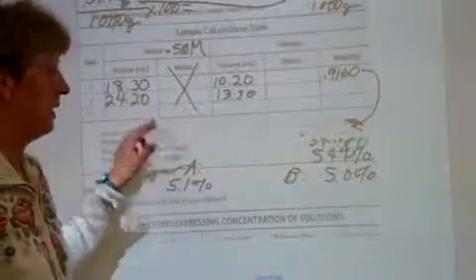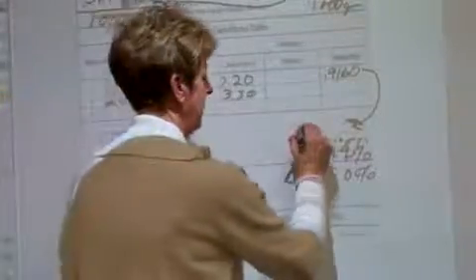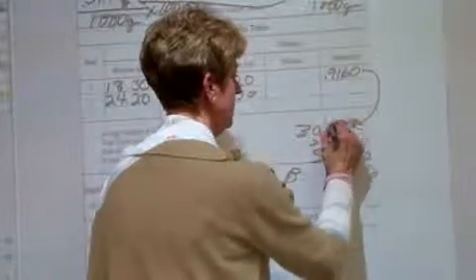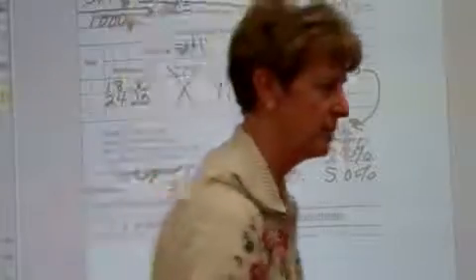Now, what's the mass of 1 mole of HC2H3O2? Not rocket science. Let's add it up. Carbon, hydrogen, oxygen, and another hydrogen. When you go to your periodic table, that's going to be in this neighborhood of 60.02 grams.